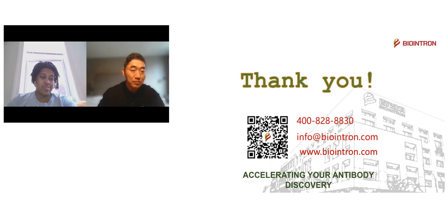Then the next question: you shared the benefits of single B cell screening over hybridoma and phage. What are the scenarios where using single B cell screening is advantageous? Good question. Say you just want to raise some antibody as a tool antibody or as a flow reagent, you don't ask about its function or its binding site, or you don't care about its diversity, you are good to go with hybridoma or phage.